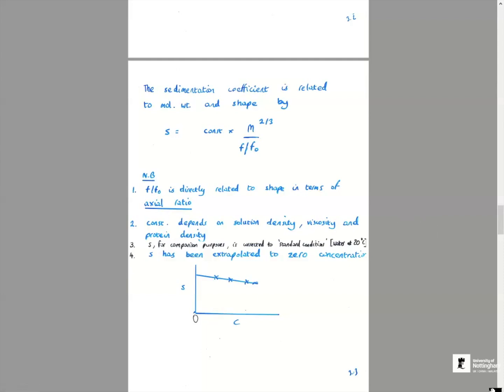Okay, folks, so I haven't been thrilled by sedimentation velocity. What was the second method, the second exciting method we can use using this technology?